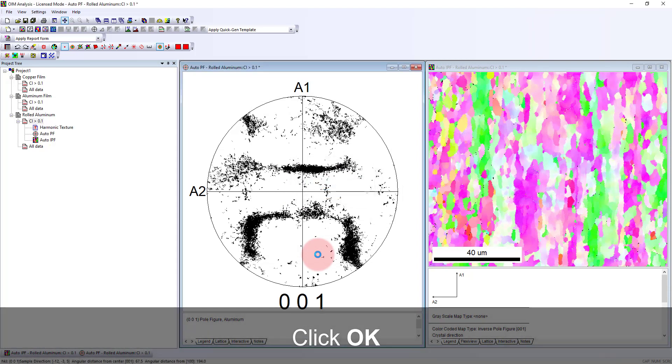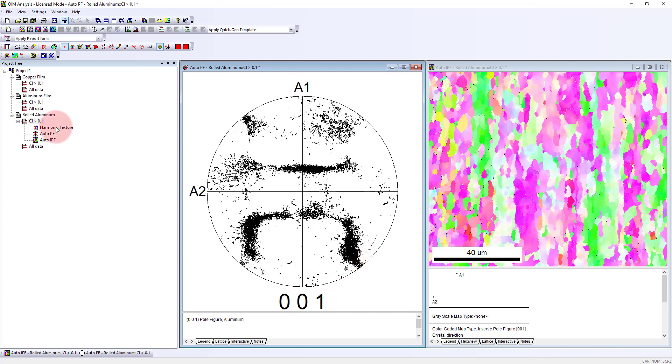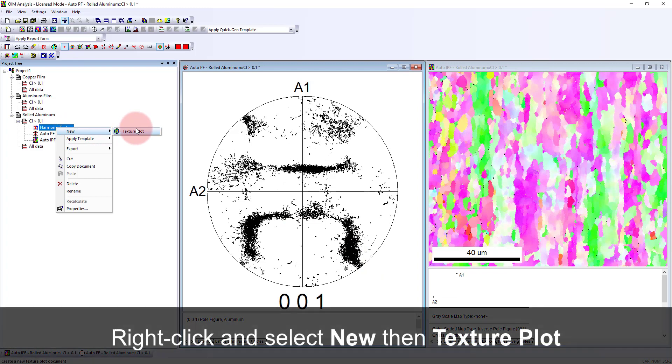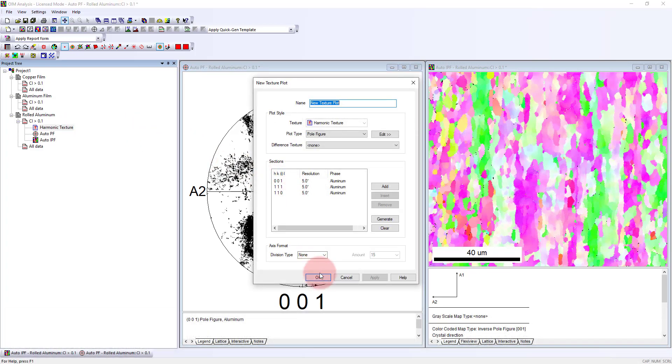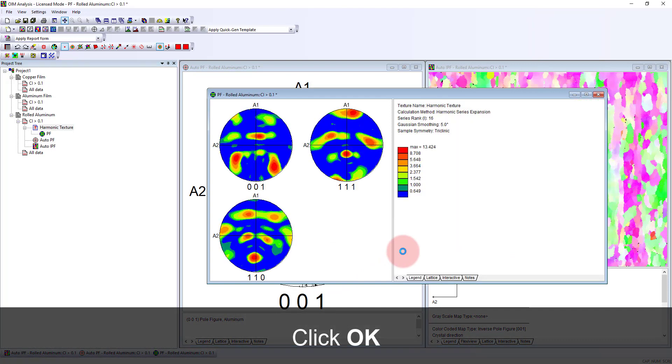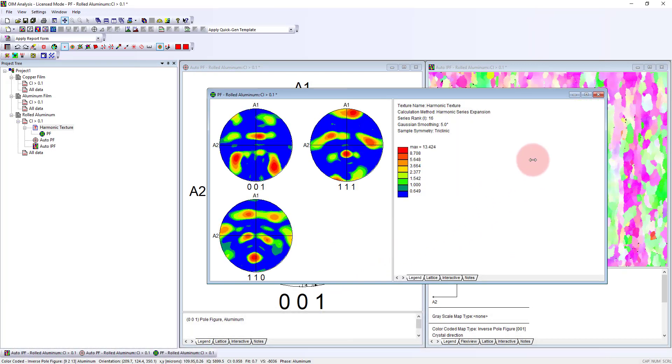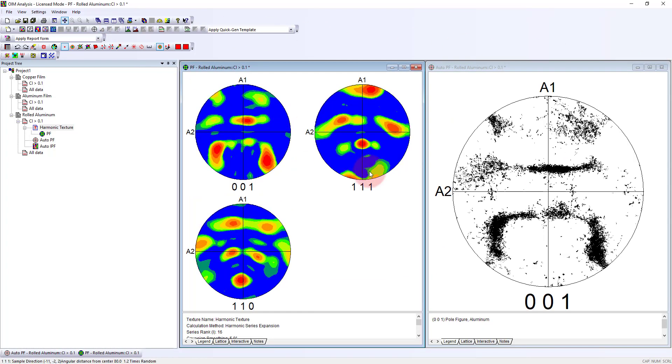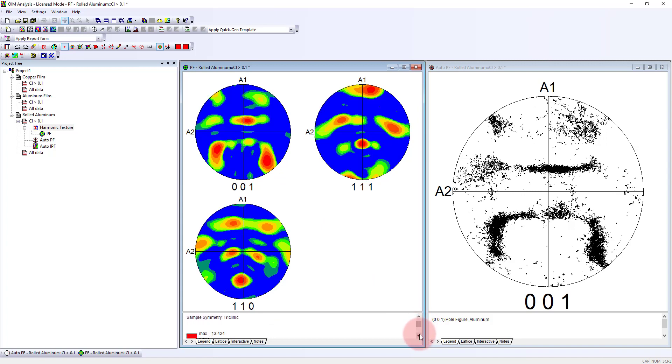For this orientation distribution, it's calculating and matching a function to describe this distribution. When we plot this texture plot, we see a density representation of that distribution. The peaks here in the 001 pole figure correspond to areas of high intensity. Down here we see a scale bar giving us an idea of the strength of this preferred orientation or texture. The maximum value is 13 times random.